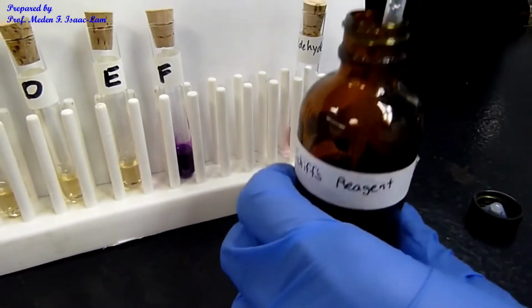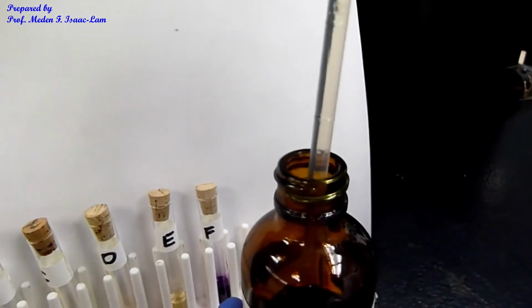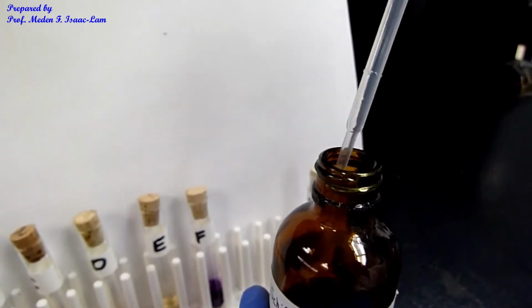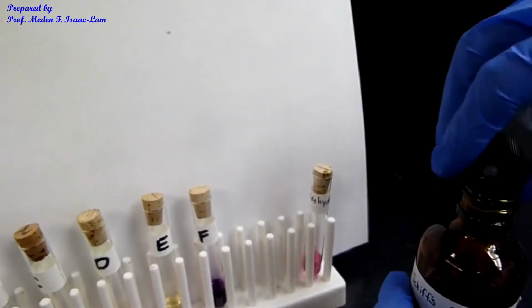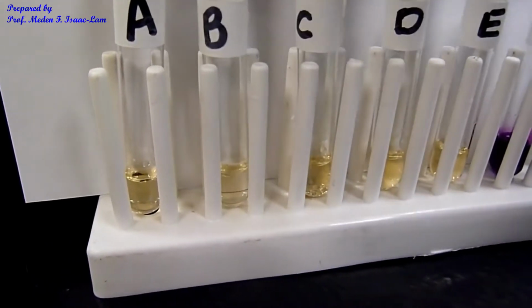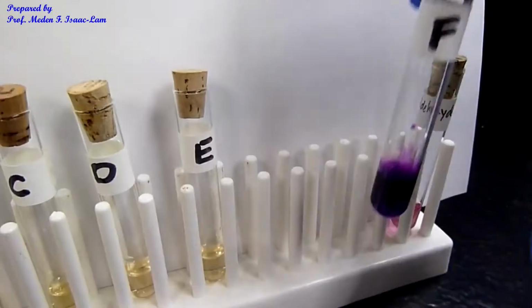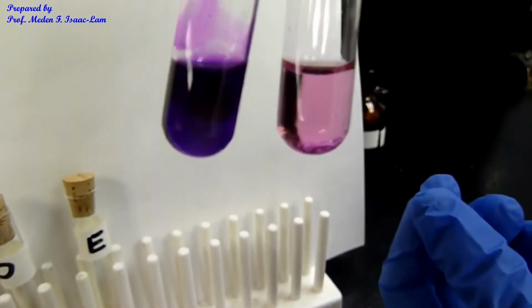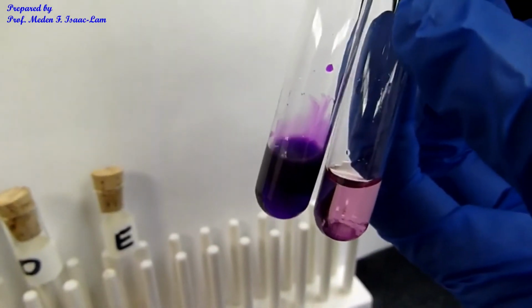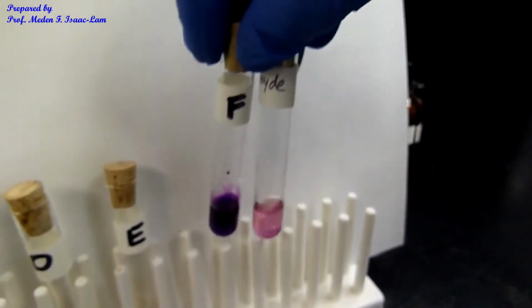If I pipette it up, it's very light yellow, almost colorless, very pale yellow color. So nothing changed, did not form a complex with the reagent. Again, A, B, C, D, E, no change in color. F, magenta in color. And then the anisaldehyde, which is the standard, is also magenta, also changed in color.